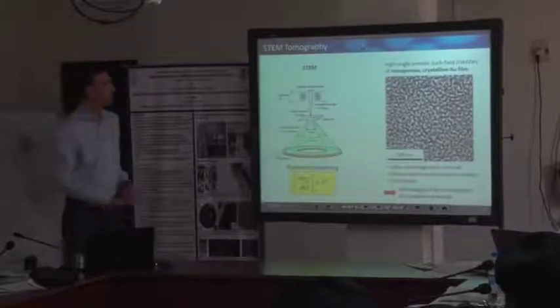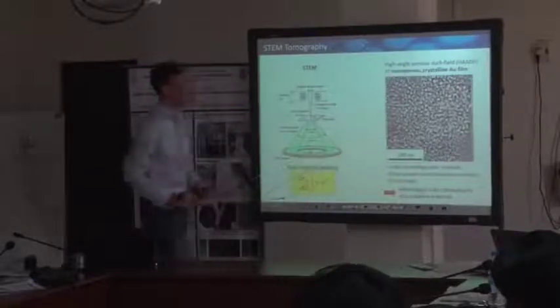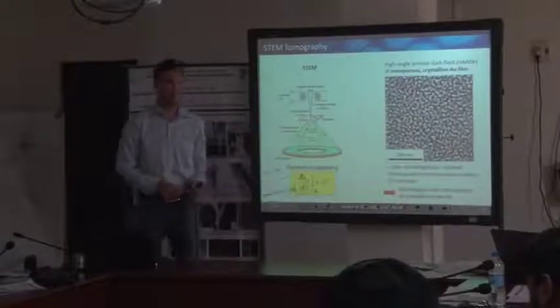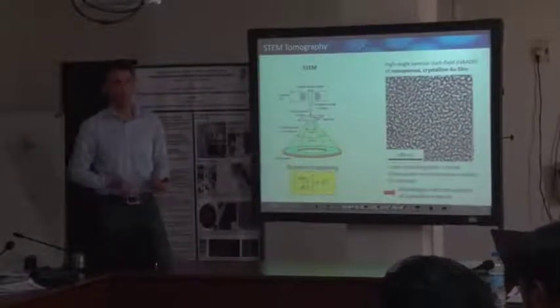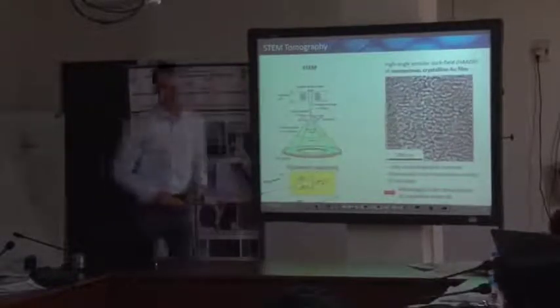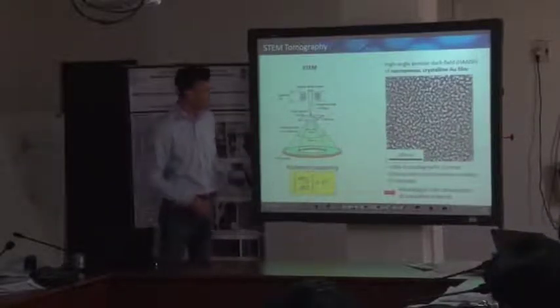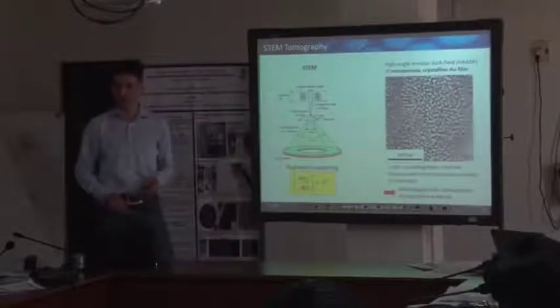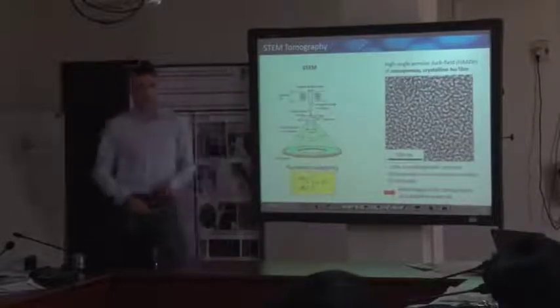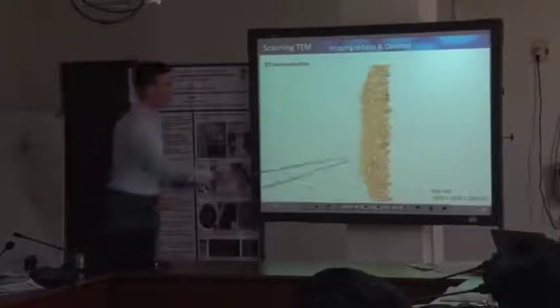There's another example of polycrystalline, highly open porous, nanoporous gold, which shows exceptional mechanical properties. Some of you might know about like smaller is stronger. So there are limitations for the generation of defects, the movement of defects, the interaction of dislocations. And this is why people are interested in open porous gold, but to understand the properties, you would have to correlate that to the local distribution of the material. This is why one of our students did electron tomography on the distribution of these struts.